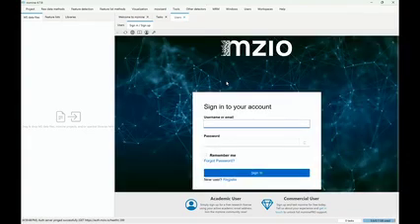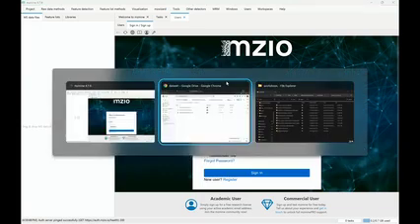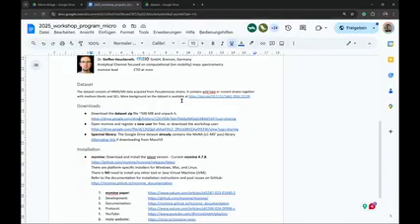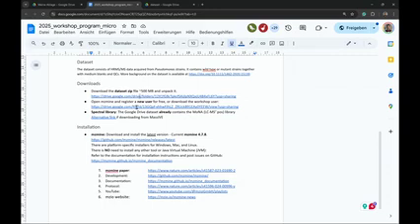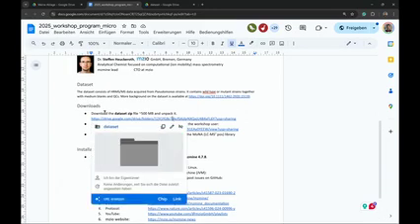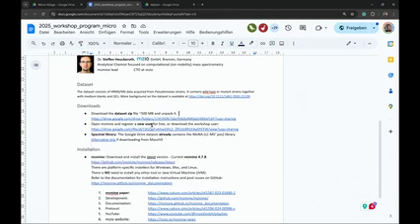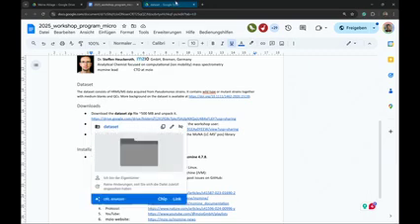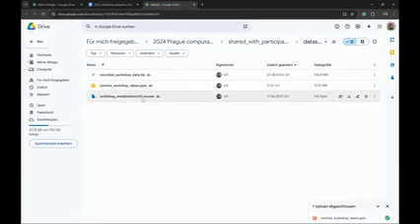So please all log in to your account, or maybe drag and drop the mz user file into mzmine. And again, it was shared on the same drive. It's a very small file, so you can definitely download this one. So with the document that came, there was a link to the user file. It's basically the dataset link as well. Or also down here, the user file directly. So if you go there, there's the workshop, Metabolomics-25 mz user, and you drag and drop it into mzmine.